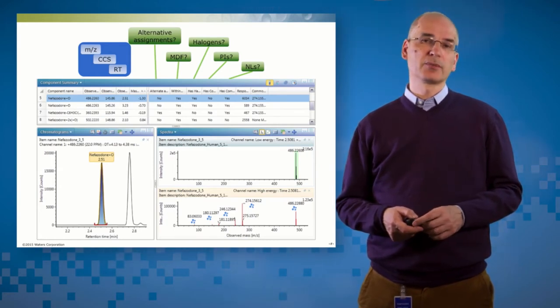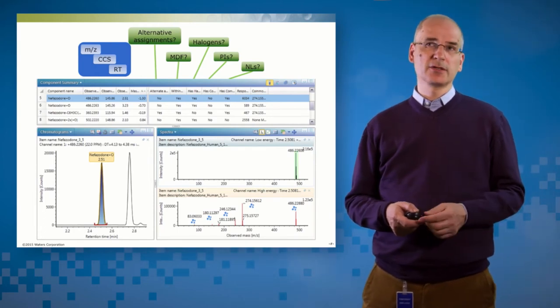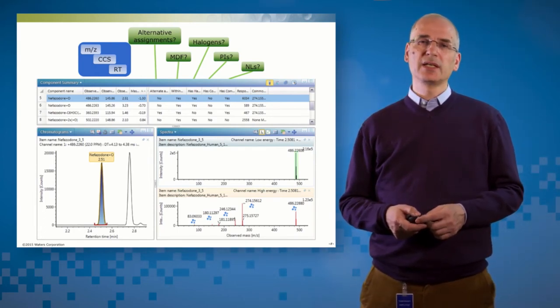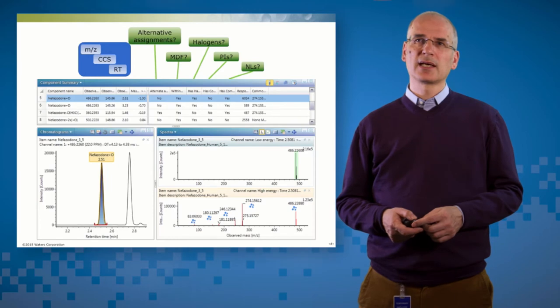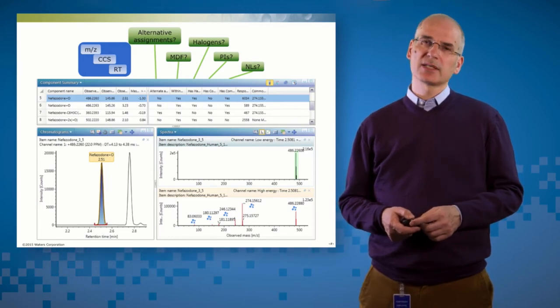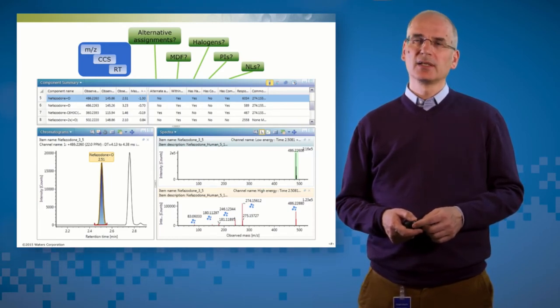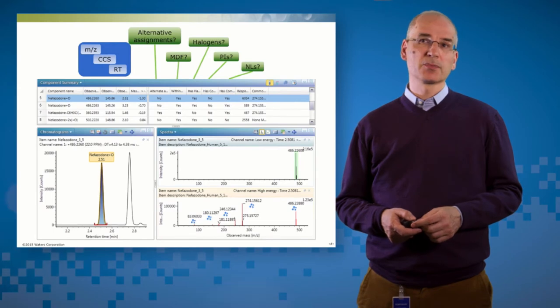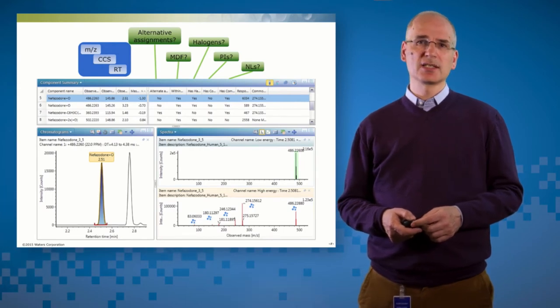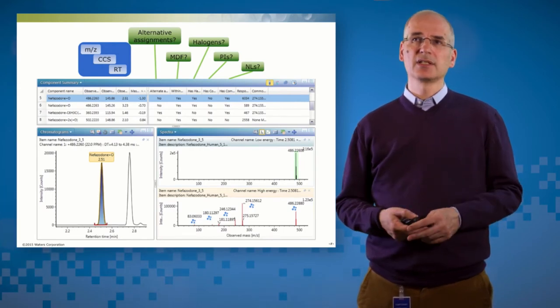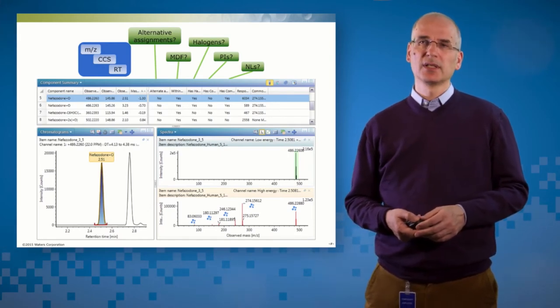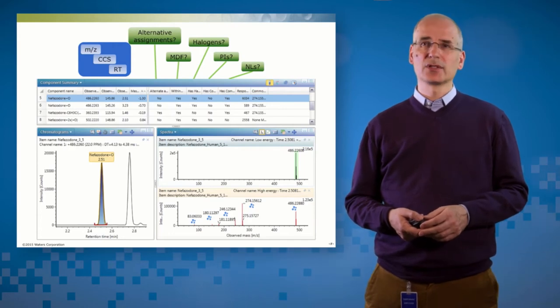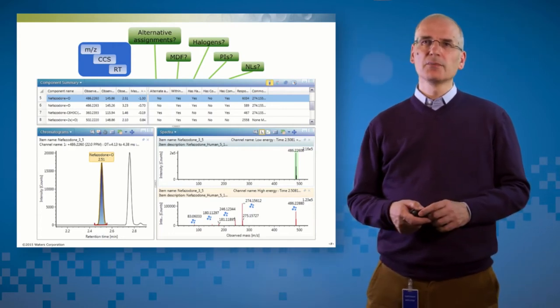Then we have a series of columns, which I've called out in green. And those are telling us something about the properties of each component. So in the first column, the software is telling me, are there any other plausible explanations for this mass change? Is that mass over charge inside the allowed mass defect space for the compound? Does the spectrum of the precursor have a halogen isotope pattern? Does it have any product ions in common with the parent? And does it have any constant neutral losses in common with the parent? So that again is allowing me to filter down to the drug-related material.